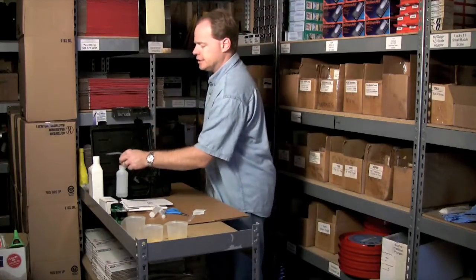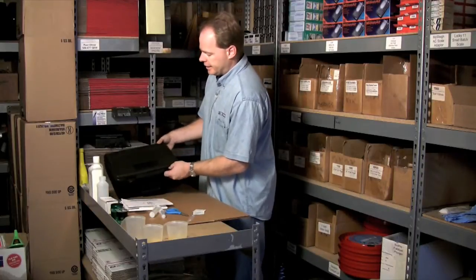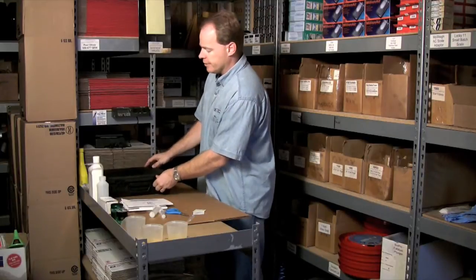It also comes with a pair of safety glasses. You can also purchase, additionally, a handy carrying case — it's just a poly case that you can put everything in and seal everything up with. So that's what we have here.